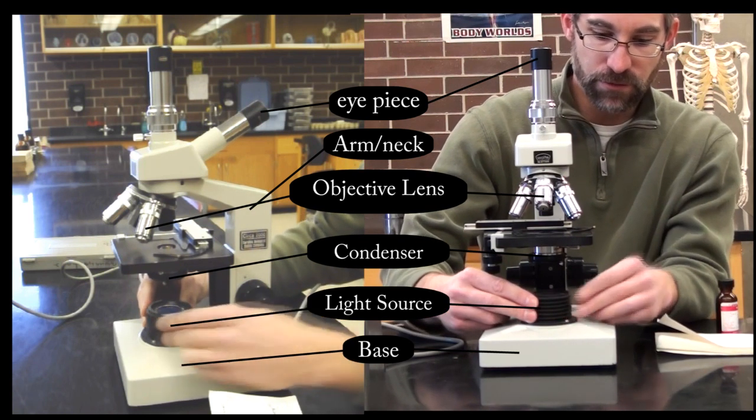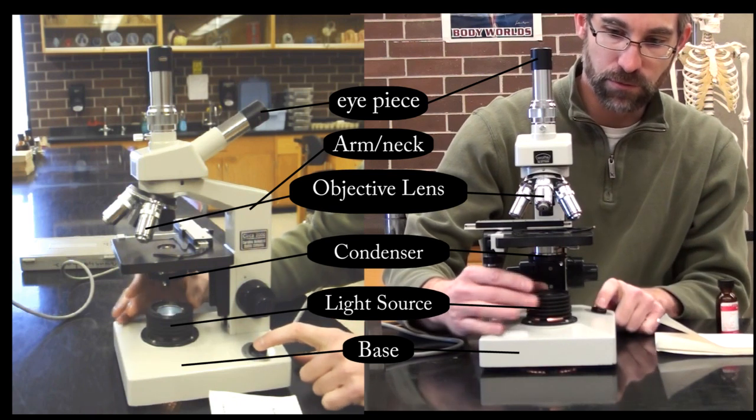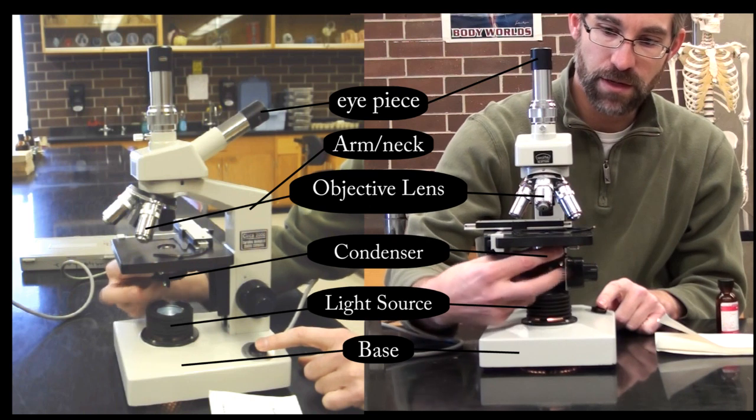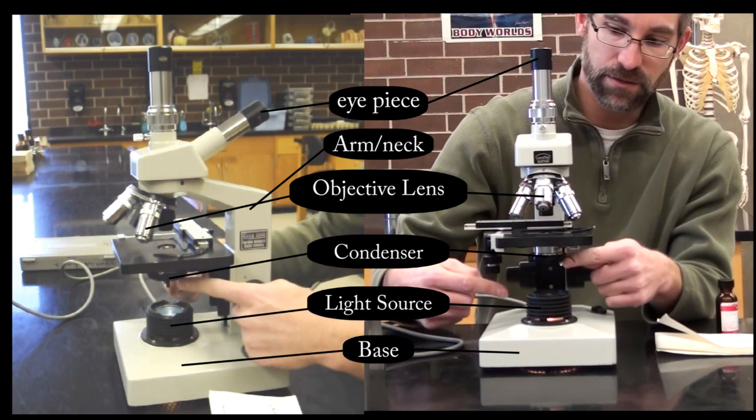We have the light source with a switch right here which will turn it on and off. This light will shoot through a structure down here, which we define as a condenser.